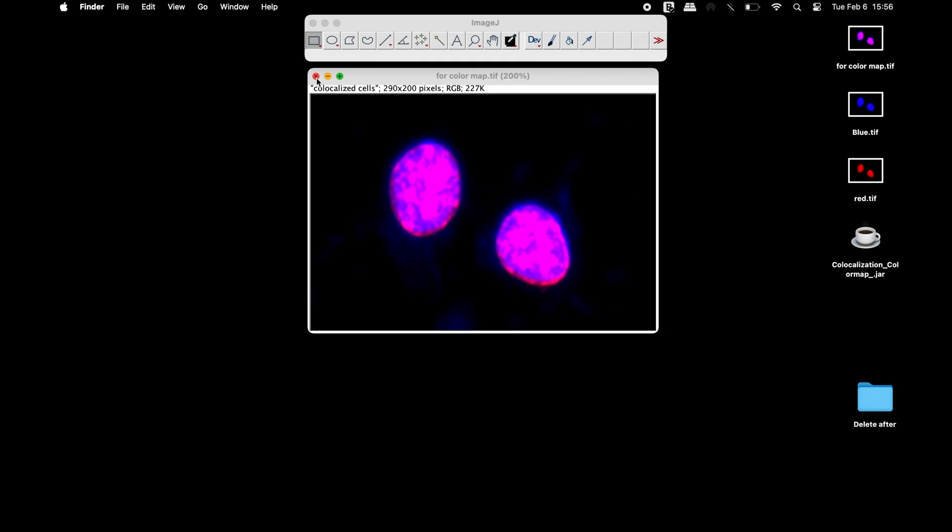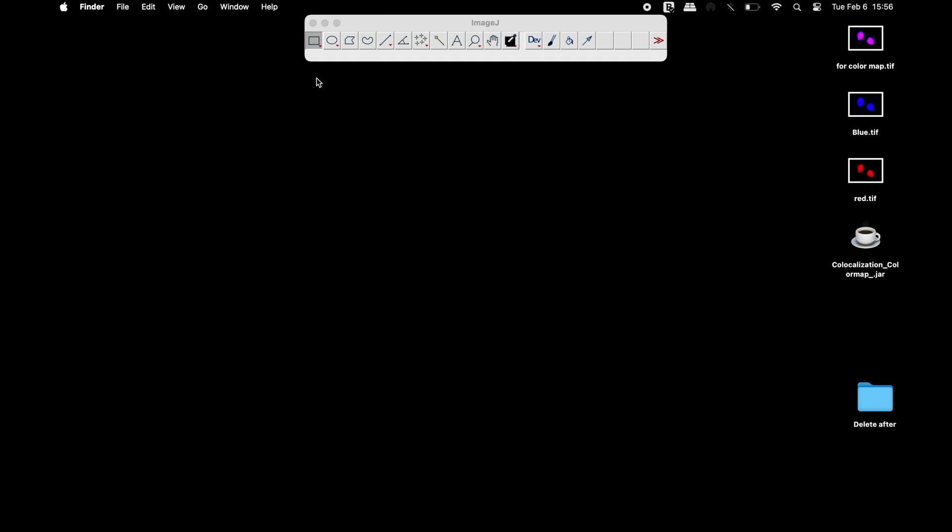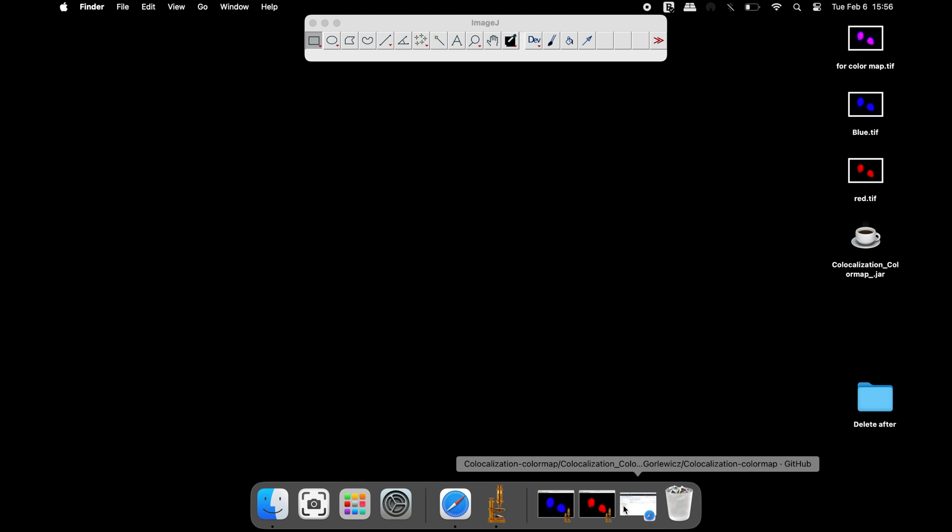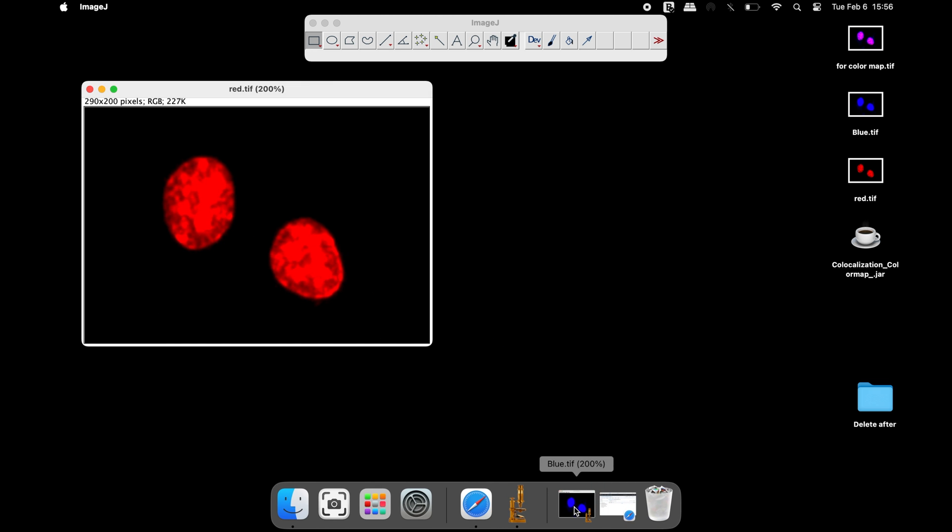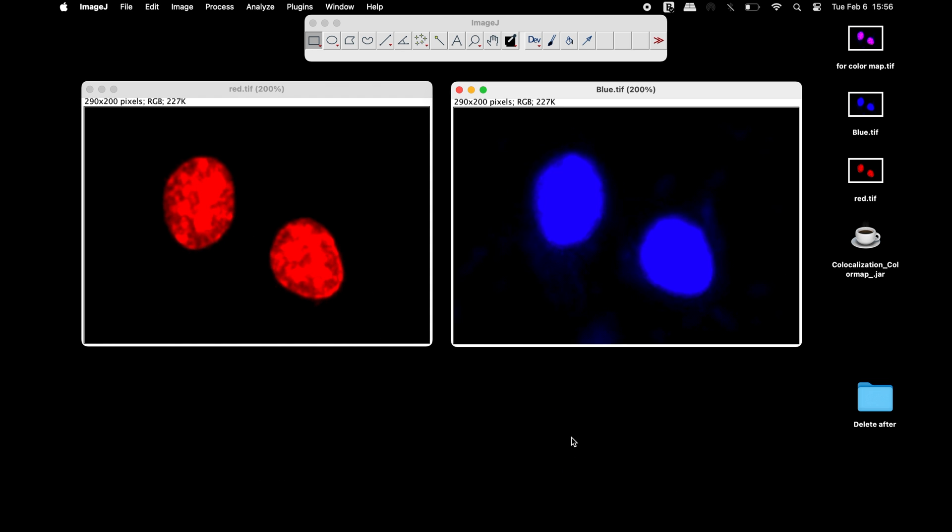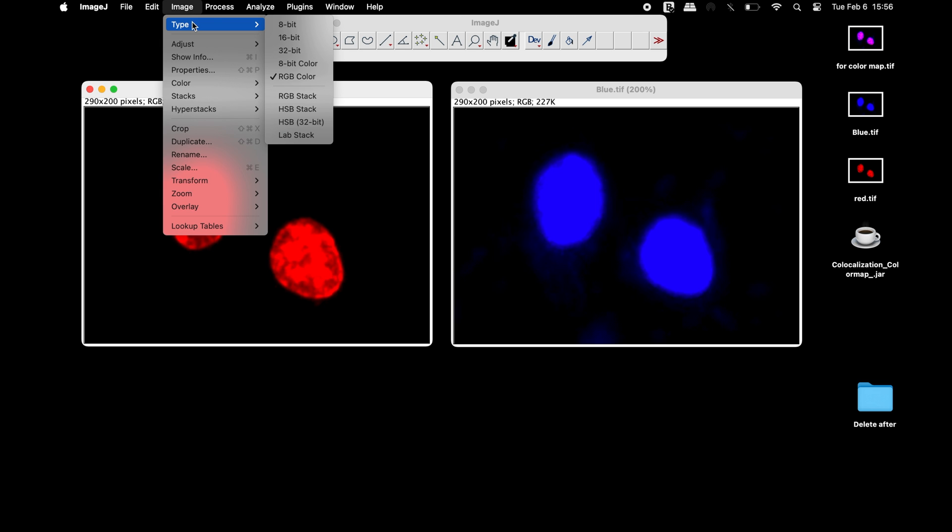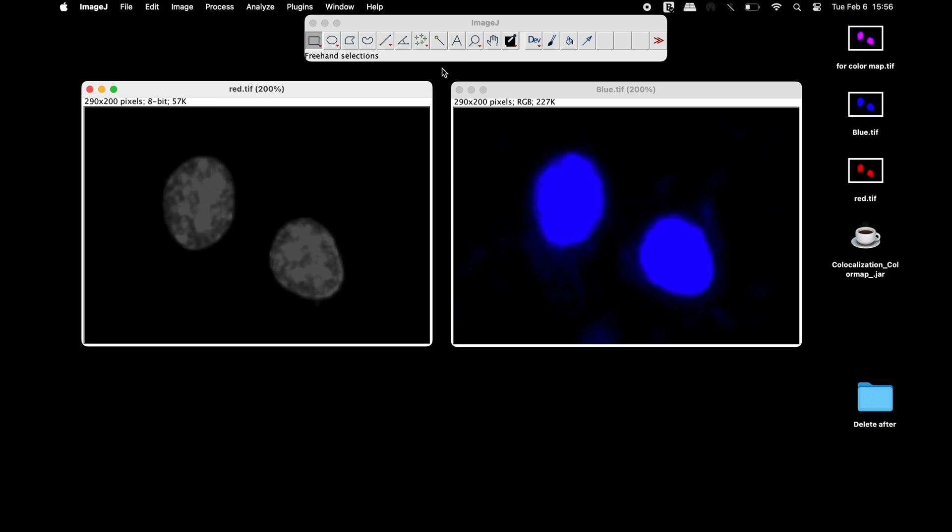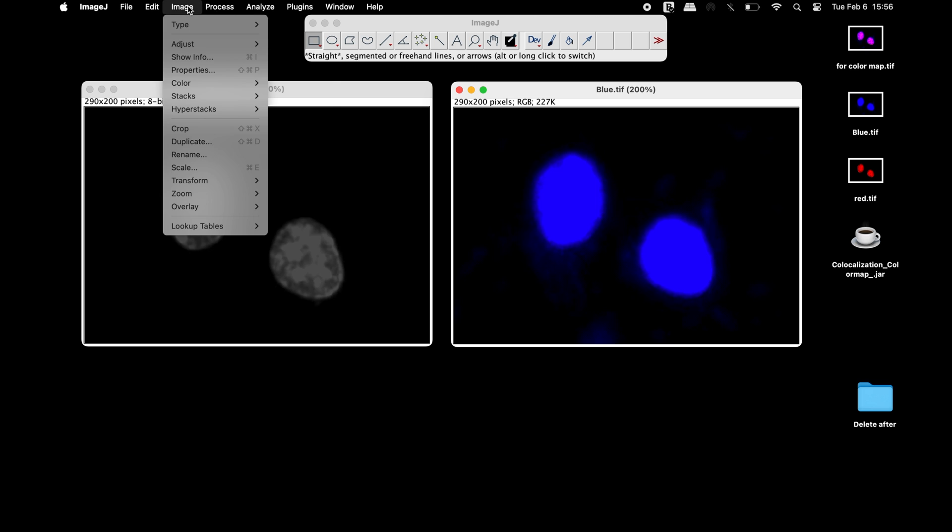To utilize the plugin, individual color channel images are required. The first step is to change the RGB image type into an 8-bit image type.